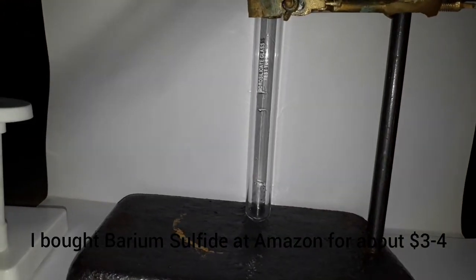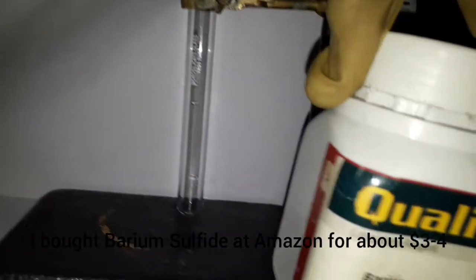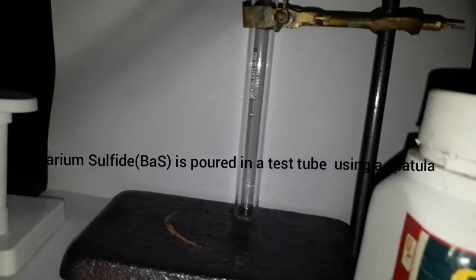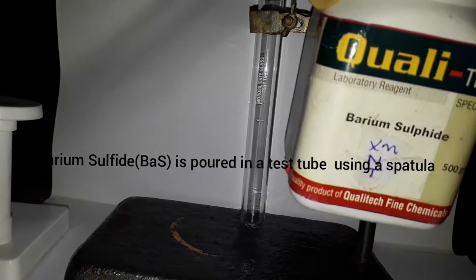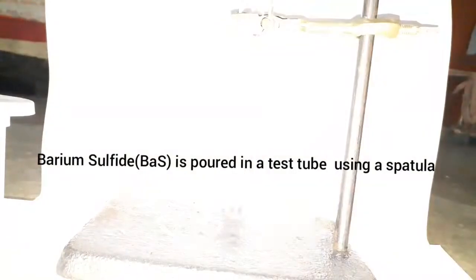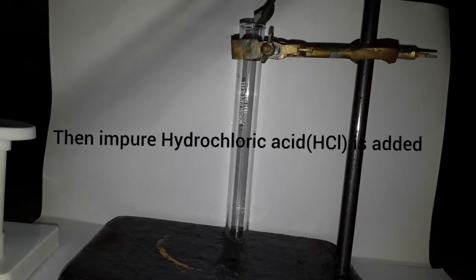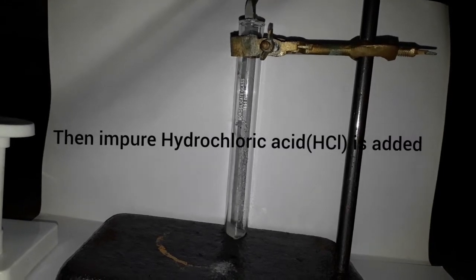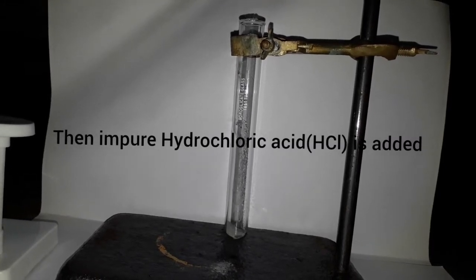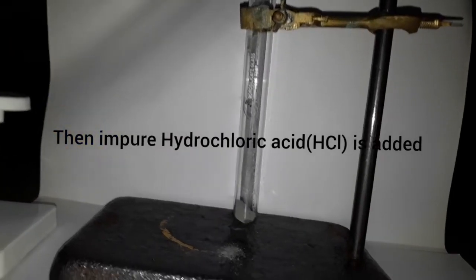A test tube. First, I have barium sulfide, which I bought online from Amazon for about three to four dollars. I'm putting this into the test tube with a spatula. You can see the barium sulfide—it's a black salt.